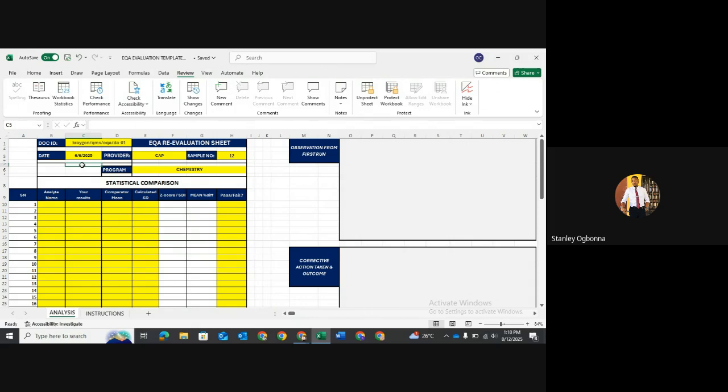Very important. And then secondly, when you look at the software, you'd observe a couple of things. The first thing you notice is that there are three different colors you are seeing in different cells. The first color you might observe is the blue color. These blue colored cells are like title cells. They stand as titles to let you know something, maybe what the preceding cell is doing or what it's saying. One thing about the title cells is that you cannot edit them. So don't even bother trying to edit them. The blue colored cells cannot be edited.